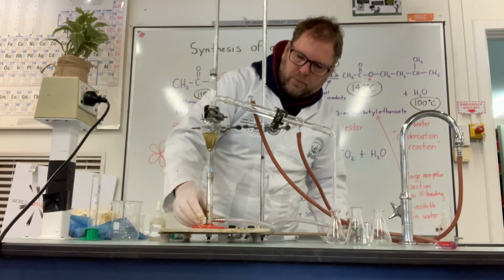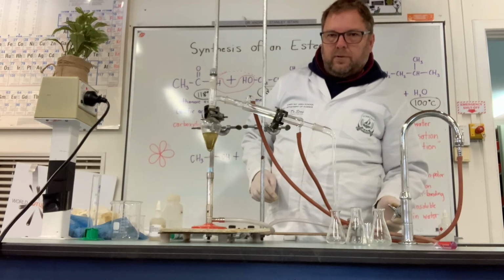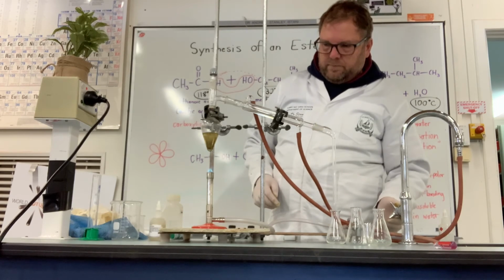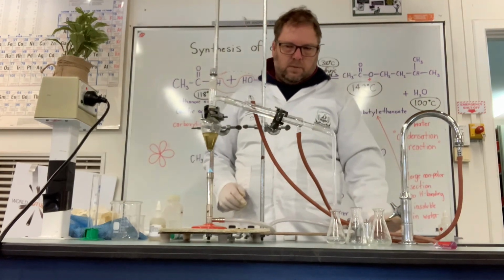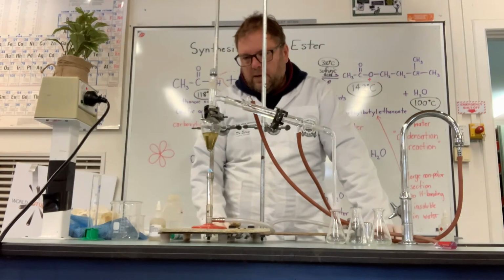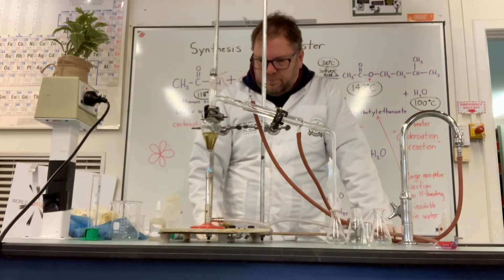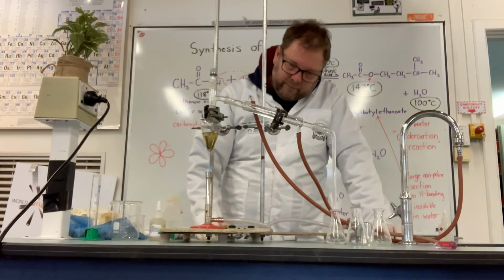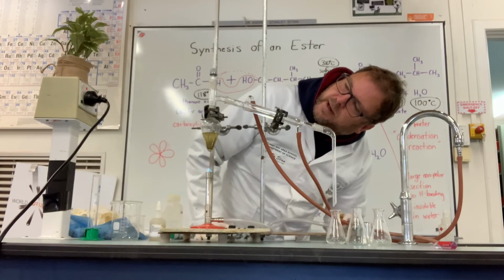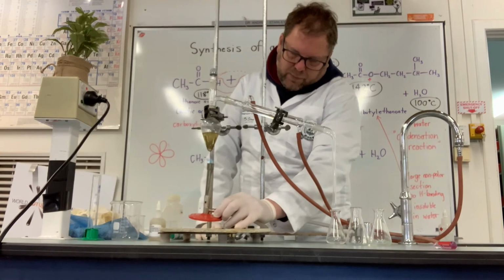You can see that's starting to boil quite quickly. Better turn the water on to the condenser. See those bubbles going through the condenser? So at the moment, we are just bubbling away. I'm just keeping an eye on the temperature of the vapors there, but at the moment, no, it's still quite low. Still at the top around about 40. Just put a bit more heat into this.